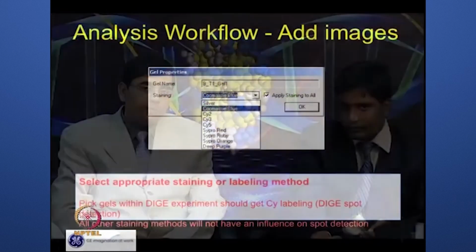These kinds of gels we cannot edit. But other than that, .tif, .gel and .mel. So it requires high resolution images, so that it can have much information in the image. A minimum of 16 bit. Exactly. At least the image should contain 16-bit resolution. Right. This is the main important thing in this software.